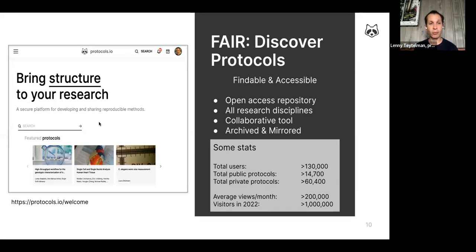So at a glance, we launched protocols.io back in 2014. And speaking of that internal and external reproducibility, there are 2 sides to protocols.io. There is the public-facing side for people to openly share, Wikipedia style, crowdsourcing the method knowledge. And that part is open access, CC BY. It's free to read and free to publish. You don't need a subscription for that. And for the internal reproducibility, when people use protocols.io in their company or inside their academic lab, that's when we charge for that internal use.